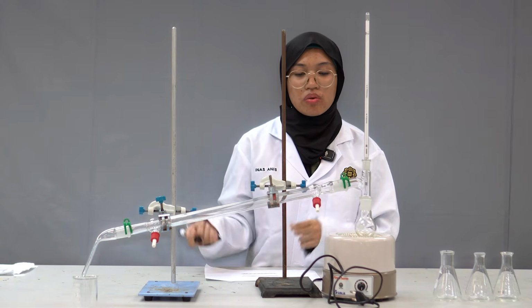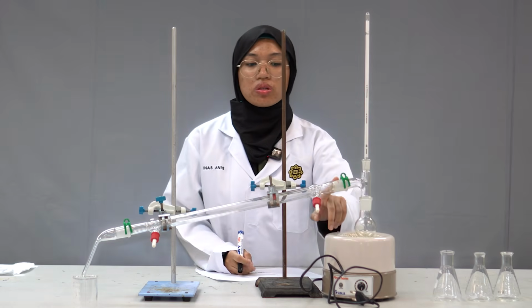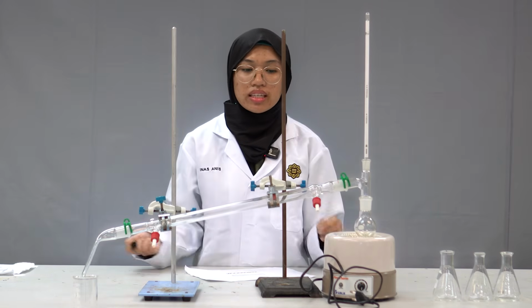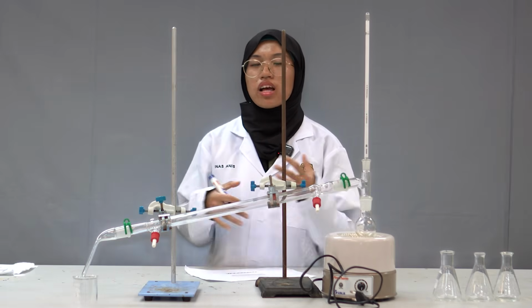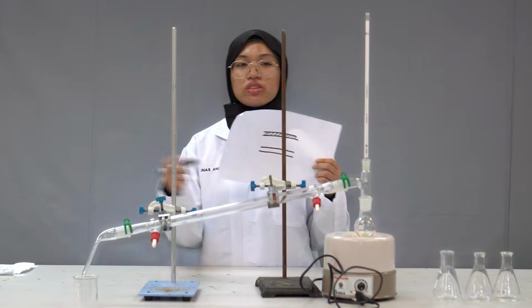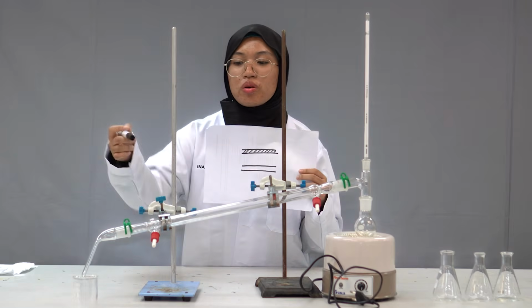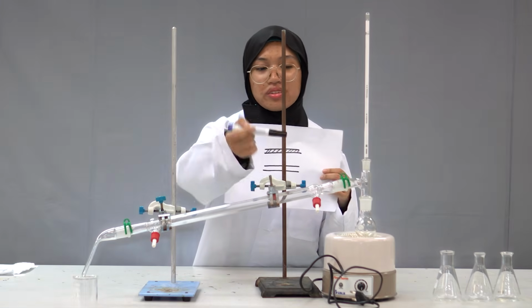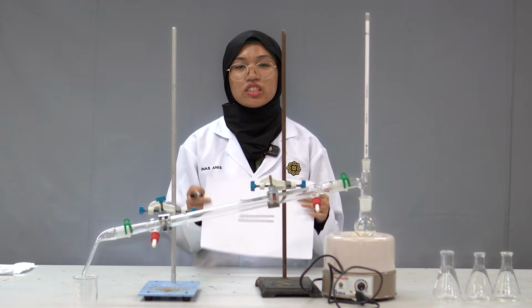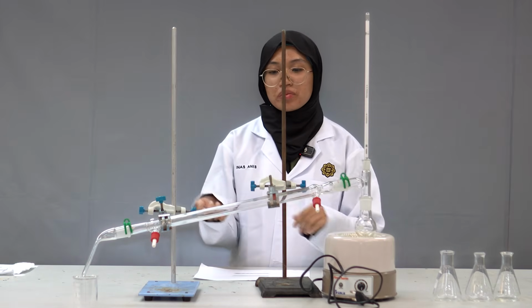And our DCM will vaporize, and once it vaporizes, it will go through this condenser. Something to note is that our condenser has an outer jacket, and what goes through that outer jacket is cold water, running from lower to higher, because we want to avoid air pockets. This is so that our vapor can cool efficiently and condense.